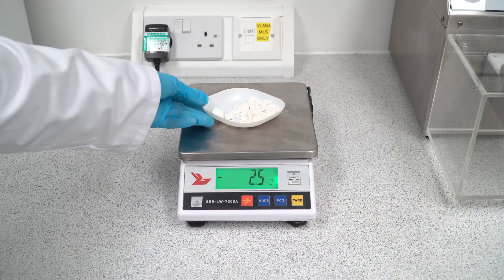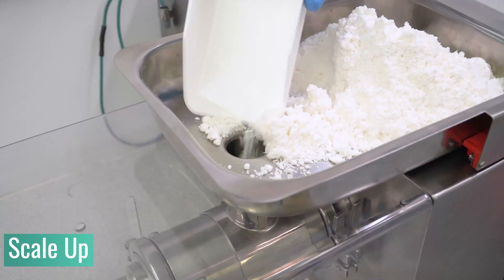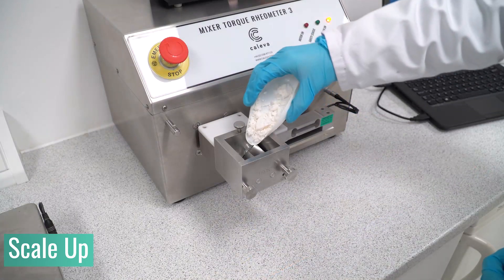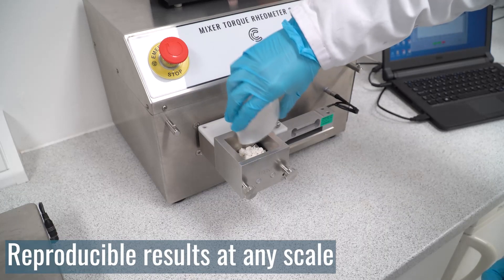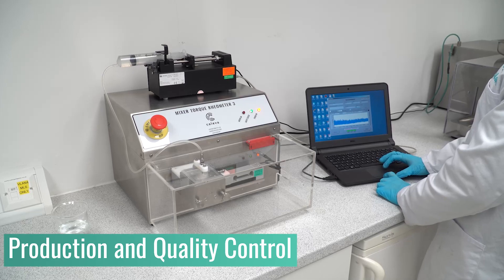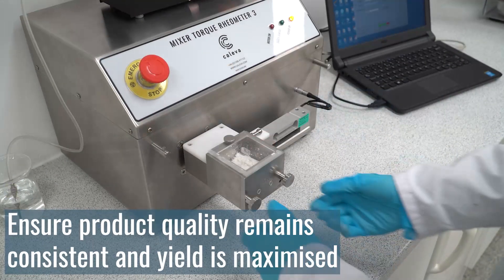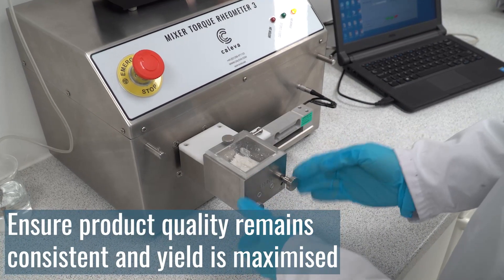Ensure a seamless transition from laboratory scale experiments to clinical trials, pilot, batch or continuous production with the MTR's consistency test for reliable and reproducible results at any scale. Using the MTR you can monitor consistency across production lines and between batches to ensure product quality remains consistent and yield is maximised.